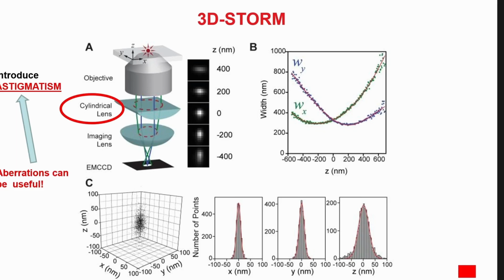Because of that, my point spread function will start to shift along the z-axis.